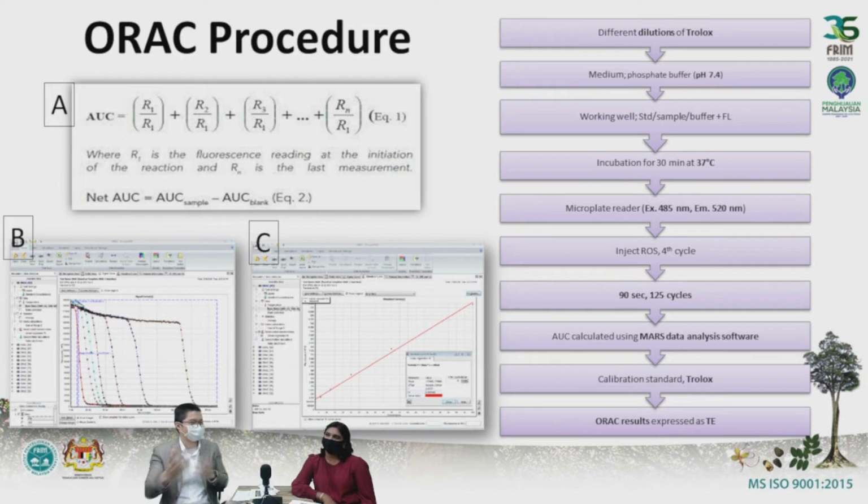Do you think the results will differ that much? Okay, this is based on my own experience when I've done both ways, automatically and also manual pipetting. Definitely there will be some changes in terms of their measurement. And when you use the automatic injector, it will give you more consistency in the measurements. Okay, that's good to hear.